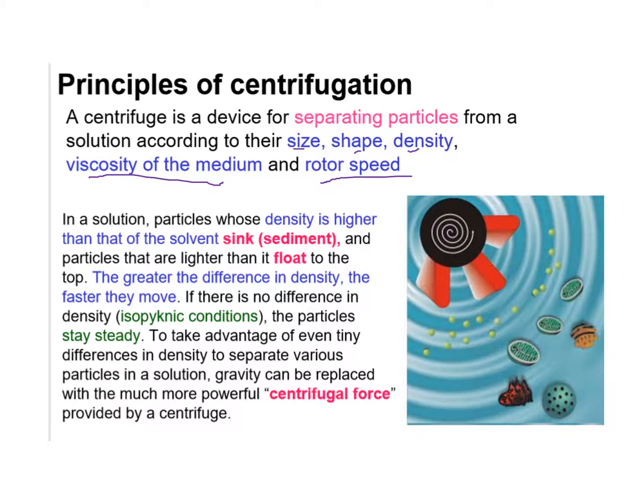It is dense, it drops below the water. So you think about that concept of density here. So in a solution, particles whose density is higher than that of the solvent sink. And that could be water, could be glucose, glycerol. It depends on what you're separating the materials in.